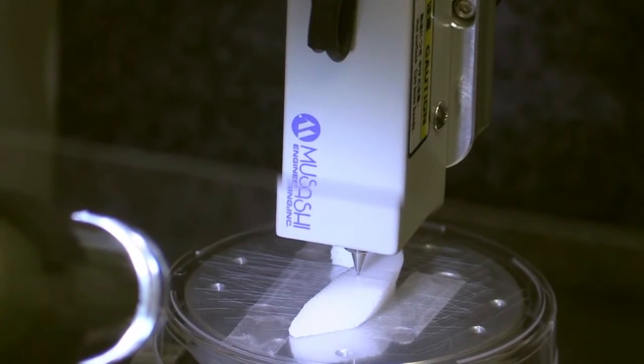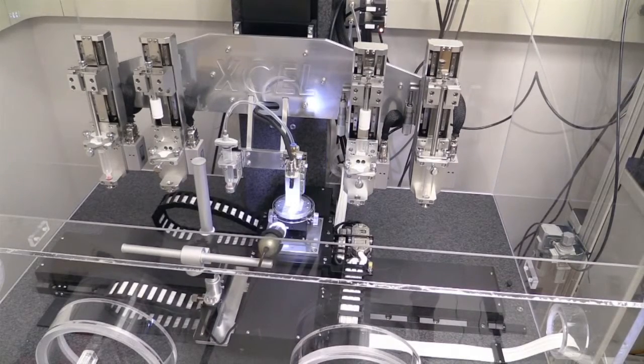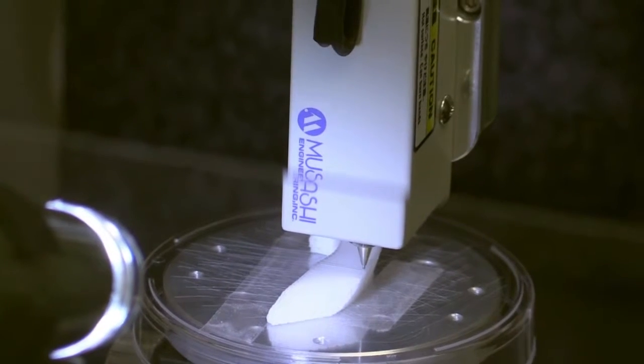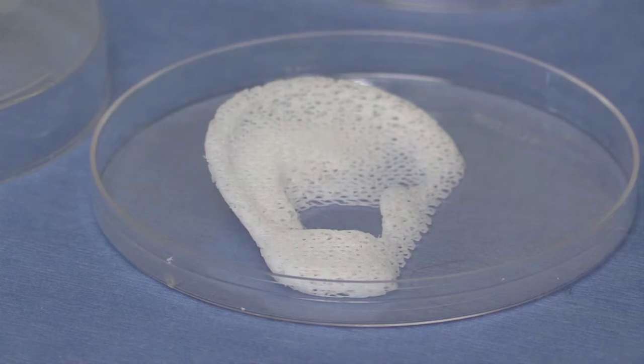This is a 3D printer more than 10 years in the making. You have three things moving at the same time, allowing the three-dimensional component of the tissue to be formed. Dr. Anthony Atala is the director of the Wake Forest Institute for Regenerative Medicine. He says this machine can print living tissues including muscle, bone and cartilage.